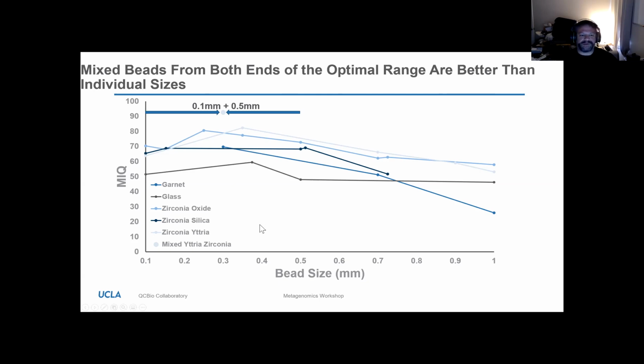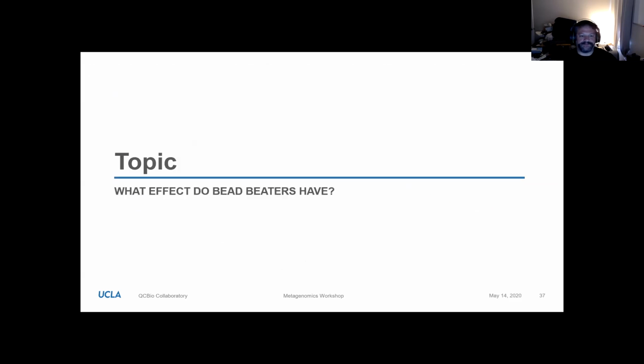But yeah, these beads come from ceramic companies, and basically they get incorporated into kits. We're definitely not the only ones who use this type of bead either. There are other companies that use ceramic beads, although they tend not to be as open with what their bead mixture is as we are. All right, what about bead beaters?